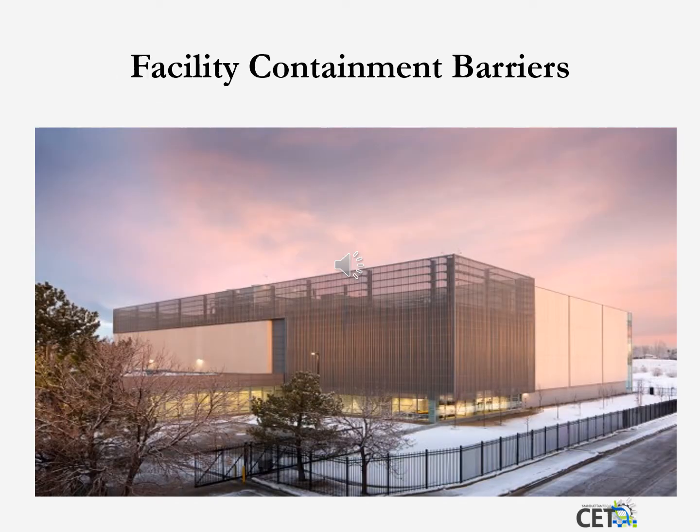We've talked about the safety features of different BSL levels of labs, but the entire building and grounds are also designed in ways to help contain microbes. This is done by creating zones of containment or isolation, and they're called, interestingly enough, primary, secondary, and tertiary barriers.